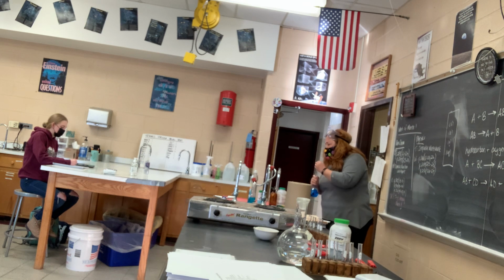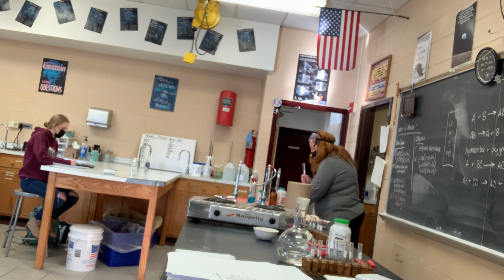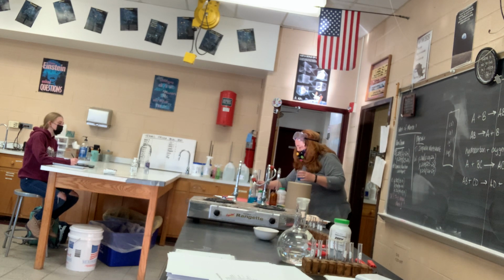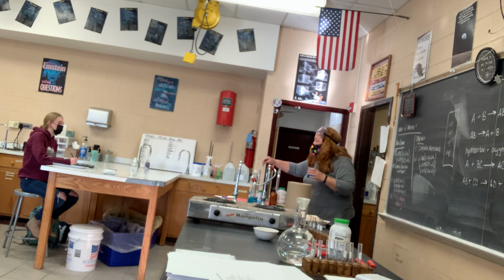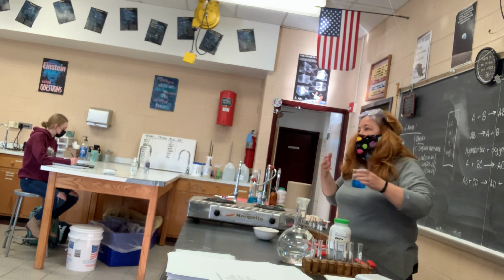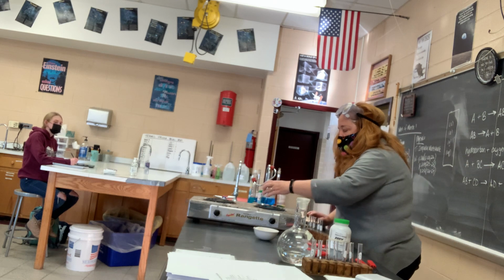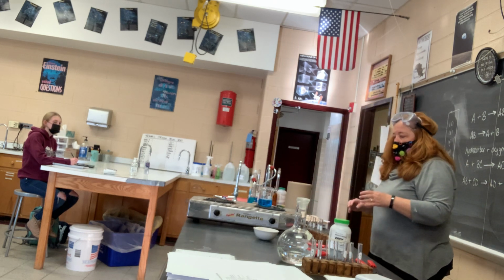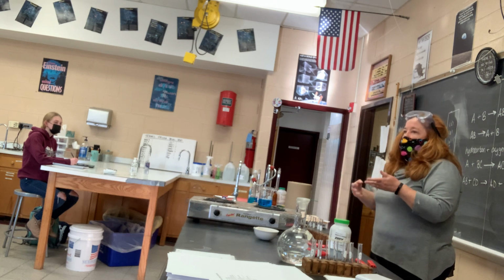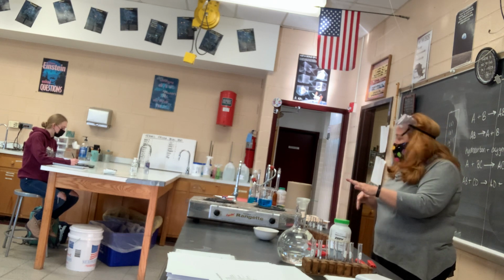So what I'm gonna do for this next part, it doesn't say to do this, but I know from experience, it tends to work better. I'm gonna heat up the copper sulfate. Reactions usually work better when they're a little bit warmer, just because the particles bump into each other more. And if they can bump into each other more frequently, then the reaction happens faster. So I'm gonna let this one go for a little bit.